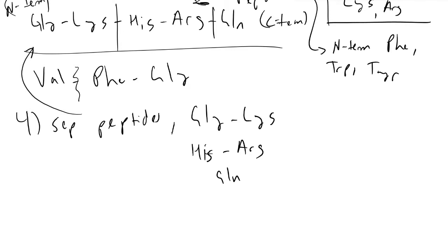The way we'll do that is we turn to chromatography. In biotech labs, you'll commonly see the term HPLC, which stands for high performance liquid chromatography. You could make a thesis on chromatography, but the gist of it is you have a stationary phase and a mobile phase, and it relies on a difference in affinity of individual unique fragments for those two phases.